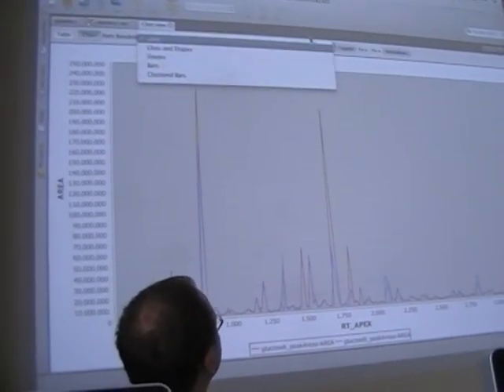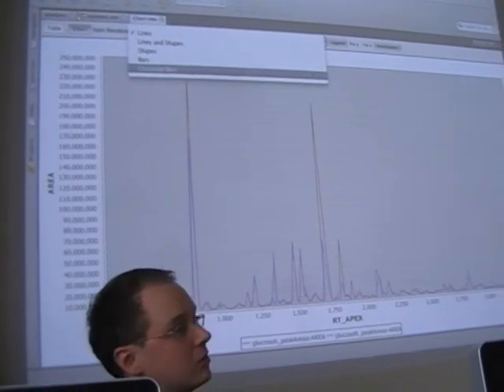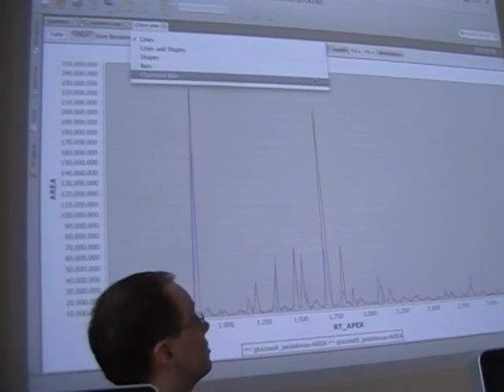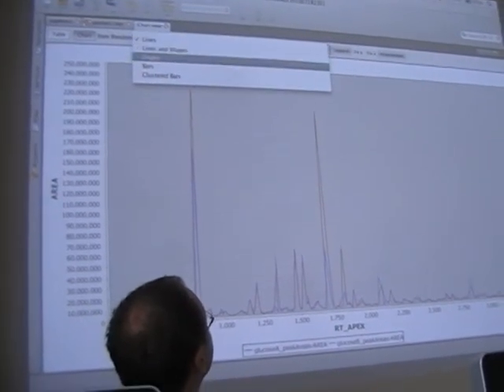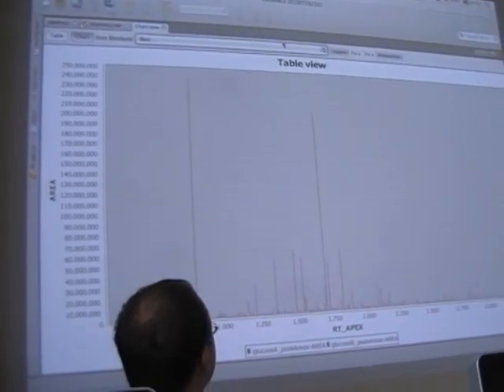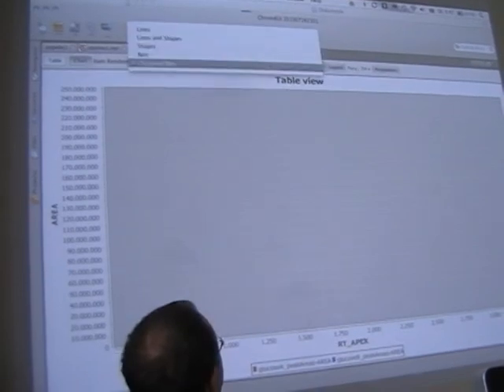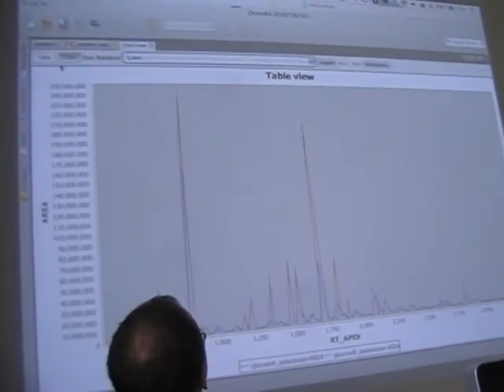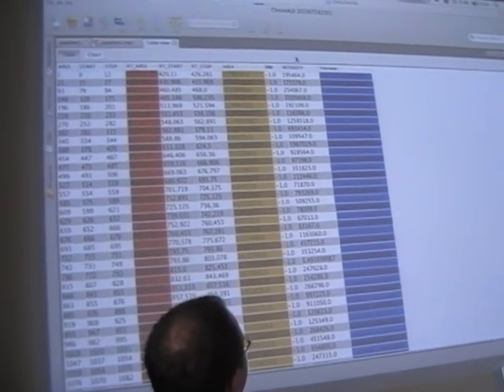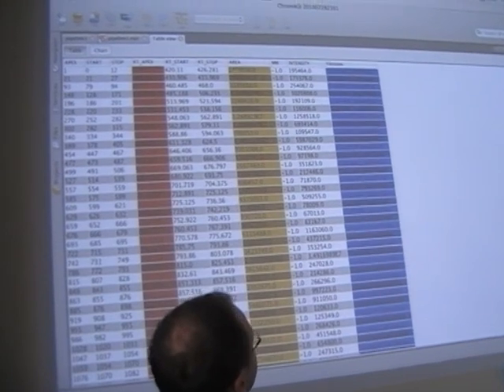This is a custom chart component that we will be using in an external module so that others can use it as well for charting. It allows to select different renderers for the shapes, for the data points, and it's quite nice like that. Oh, this one is not really nice. And you can use this table to explore your data and visualize some things that you got. For example, here the peak areas.